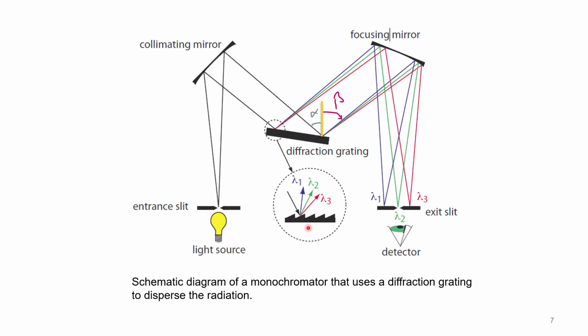So this is how it is further explained where the alpha position is, which is the incident light angle, and the beta position referring to the radiations which are dispersed from the grating, and what the respective angle is.